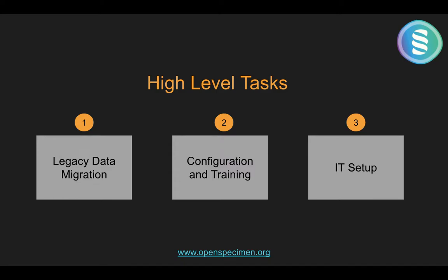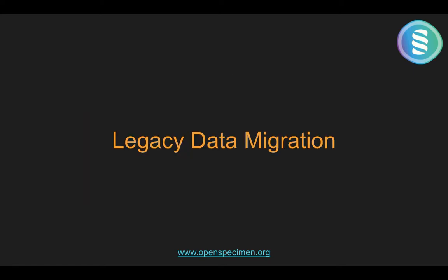First is legacy data migration, which is the most time consuming and rate limiting step in the overall process. Second is configuration and training. Third is IT setup. So we'll go one by one through each, understanding what all things are part of this high level task. We'll start with legacy data migration.